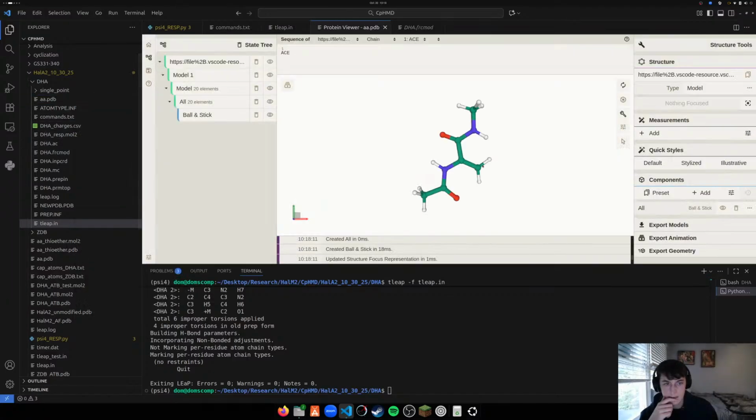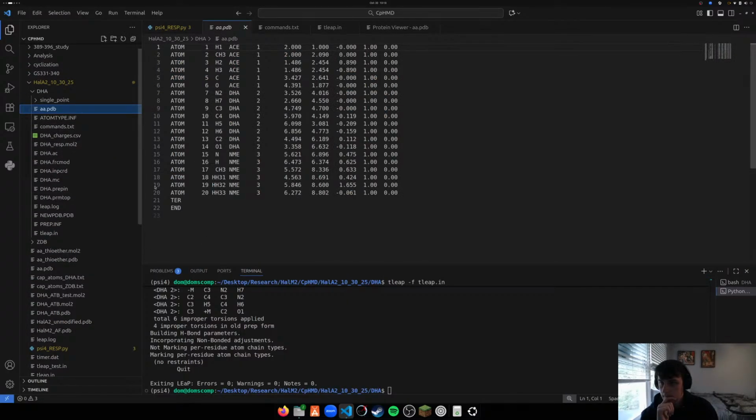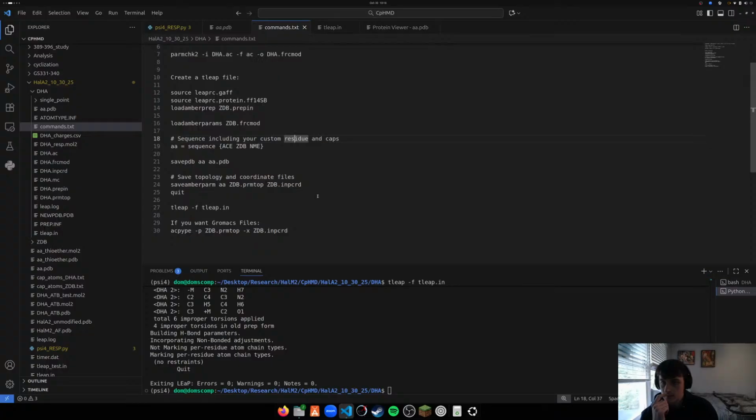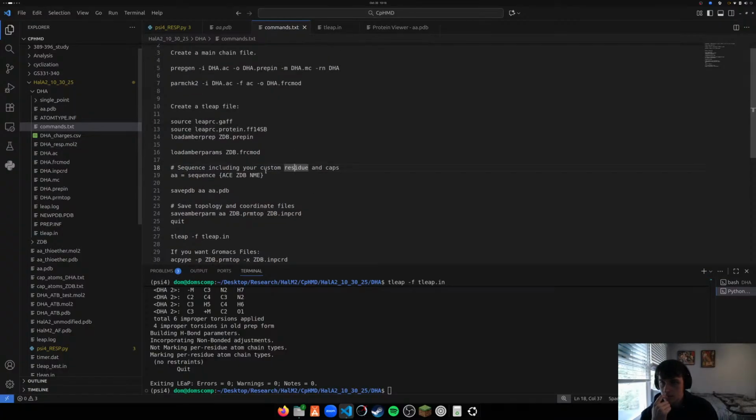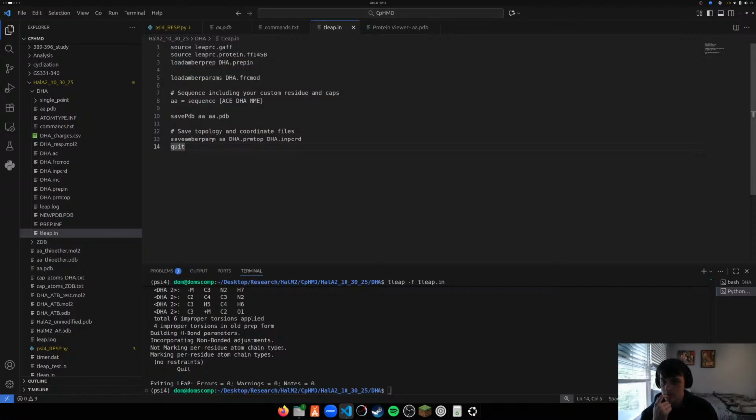So we can look at AA. Yep, looks good to me. And let's save it as a mol2 because I want to see something.